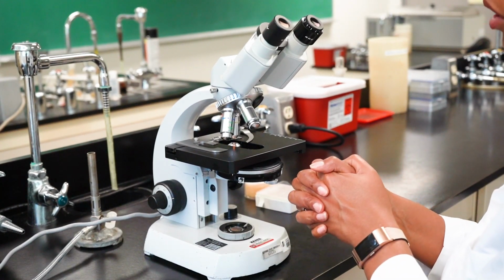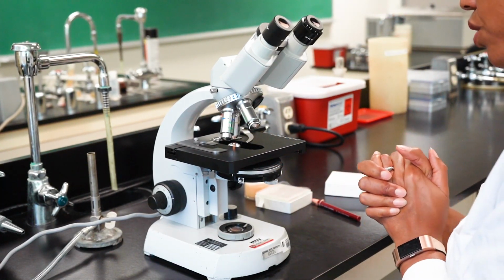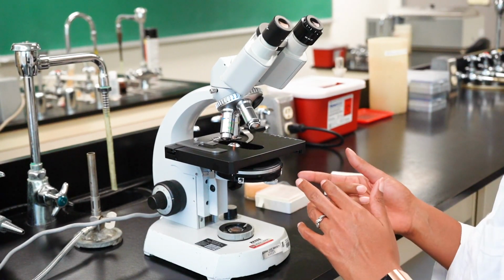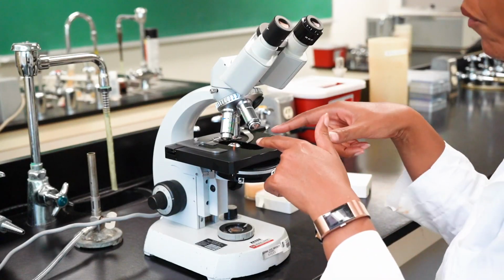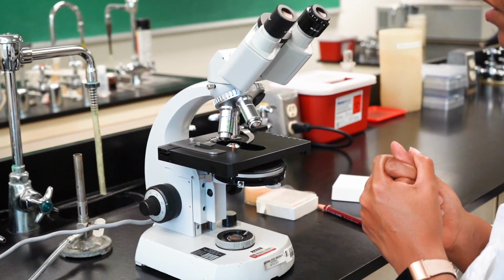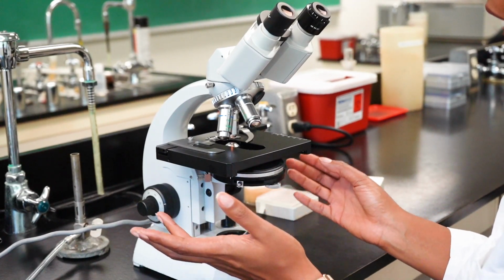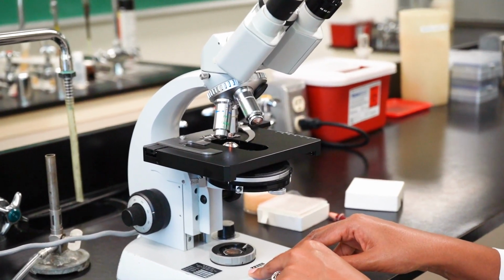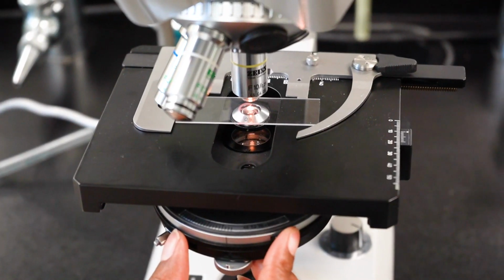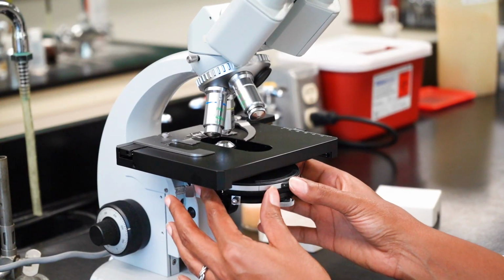So the first thing I'm going to do is to prepare the microscope for use in bright field at all magnifications. All right? So in bright field, we need to make sure the condenser setting remains on J, okay? And we need to properly size the iris diaphragm that's inside of the condenser housing. Right now, the iris diaphragm is completely open. So just like with the lamp diaphragm, if we want to focus on it or see it, well, first we're going to have to close it. So close that iris diaphragm all the way down so that it's as small as it can be.